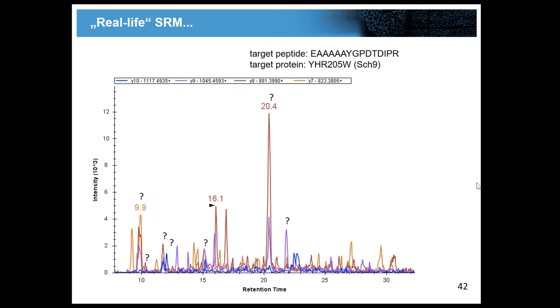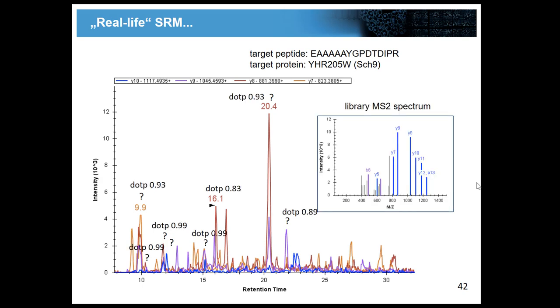An isotope labeled peptide. That's what I said. It's the strongest one. Unfortunately, I didn't have an isotope labeled peptide, and I wasn't allowed to buy one. So what I did was, it was done in yeast. So I grew a 15N labeled yeast sample. That was very cheap. And then I made a 1-to-1 mixture of a 15N labeled yeast sample.